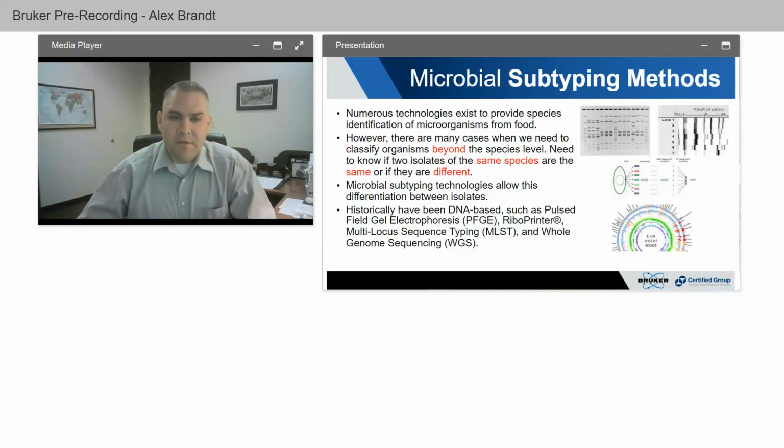Historically, a lot of these subtyping technologies have been DNA-based, such as pulse field gel electrophoresis, which a lot of people are familiar with, also known as PFGE. A lot of people recognize that acronym.